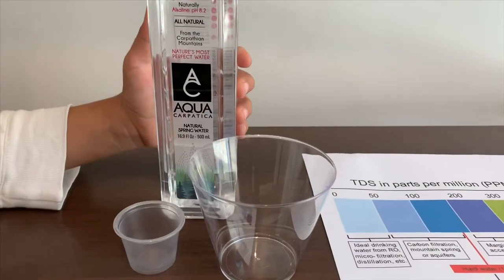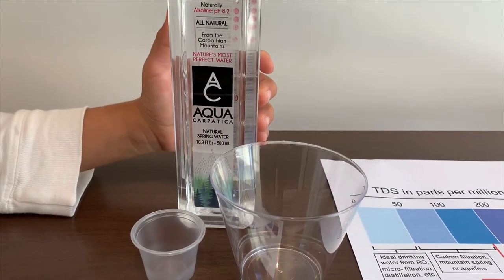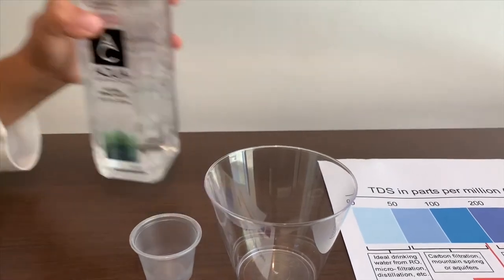This is Aquacarpetica natural spring water. It's supposed to be alkaline at pH 8.2, and it's from Romania. It costs $0.92.